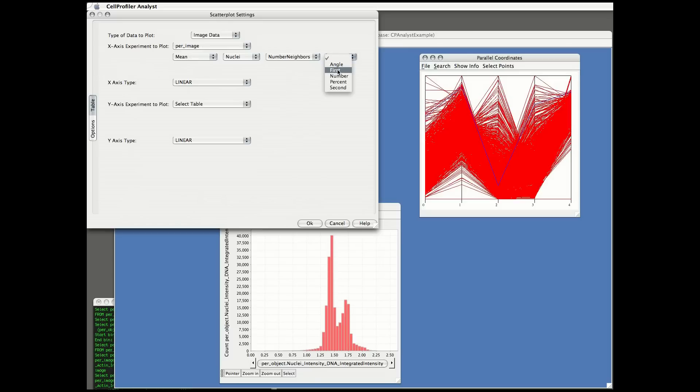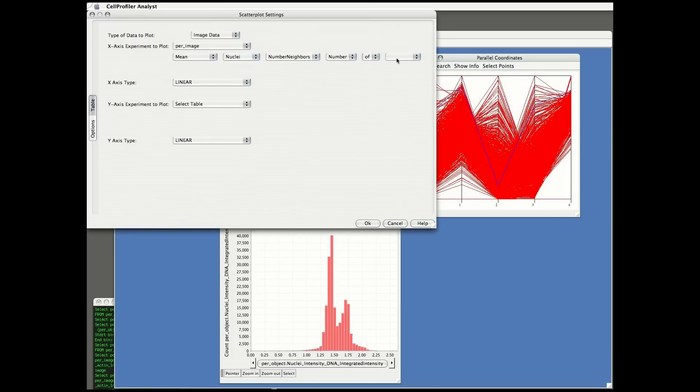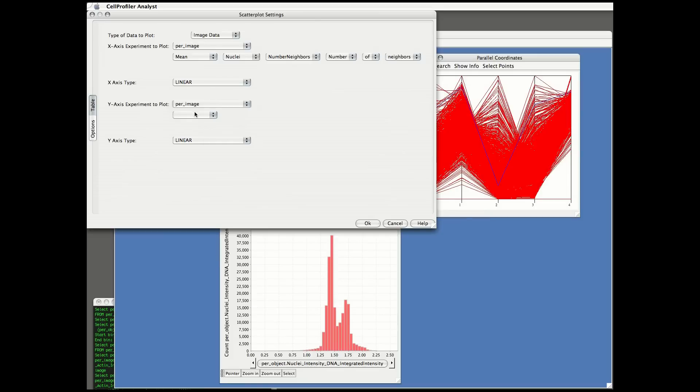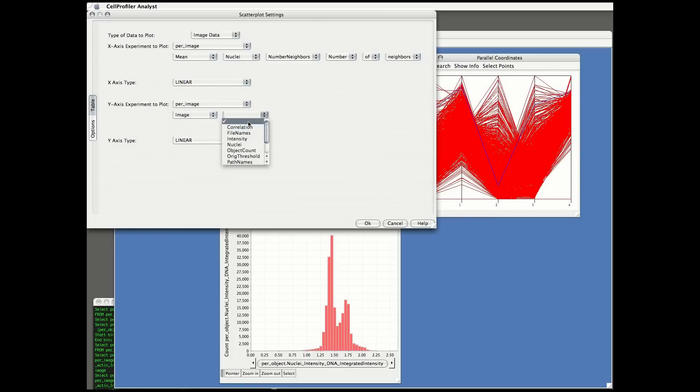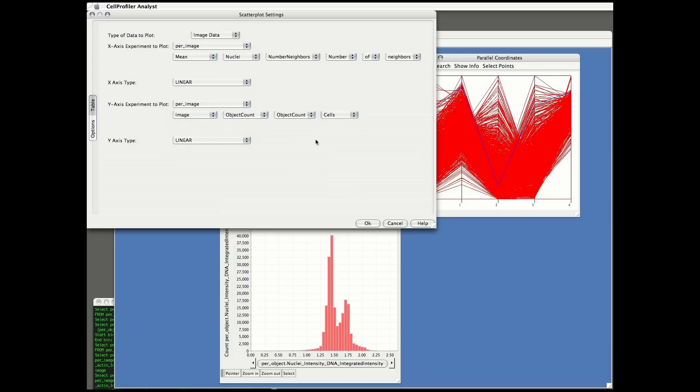You've seen a glimpse of it already in that the one blue point in the scatter plot appears blue in the parallel coordinates plot, but here you'll see it become much more powerful. I'm plotting here the object count on the y-axis and the number of neighbors that each nucleus has on the x-axis.